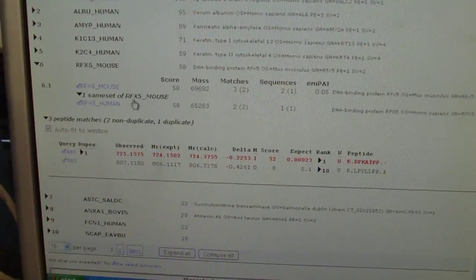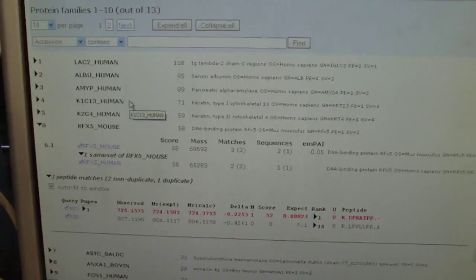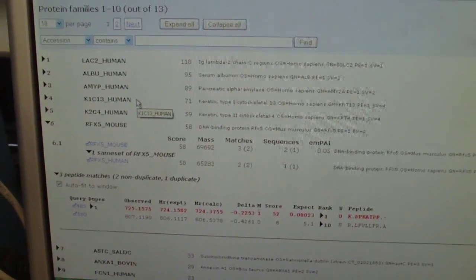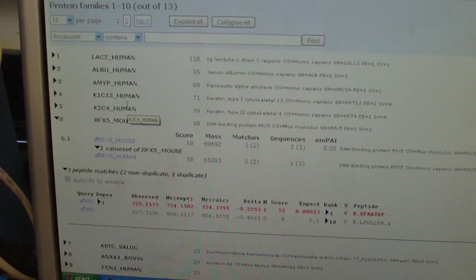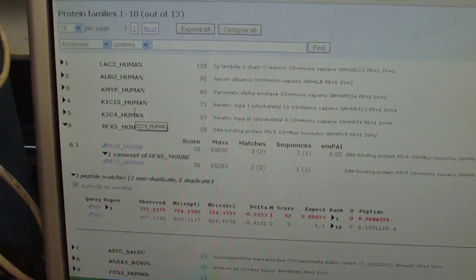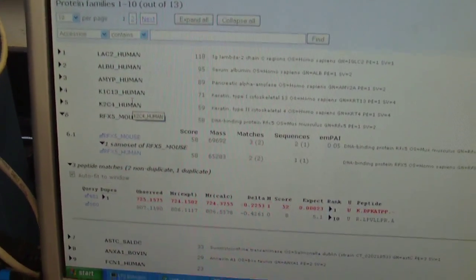Okay. All right? So we're just doing a qualitative thing. We want to know what proteins are in people who do and don't have diabetes, right? So you'd want to collect all of these from one sample and say they don't have diabetes, and then next one they do have diabetes, and then start trying to see patterns at that point. And we can talk about further data analysis at that point. Does that make sense? Yep.